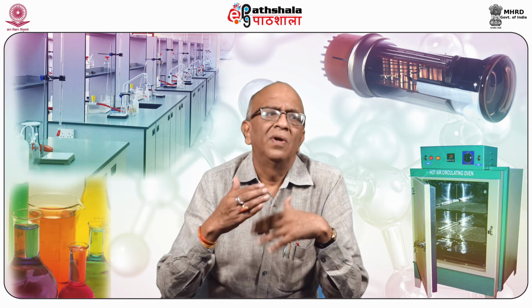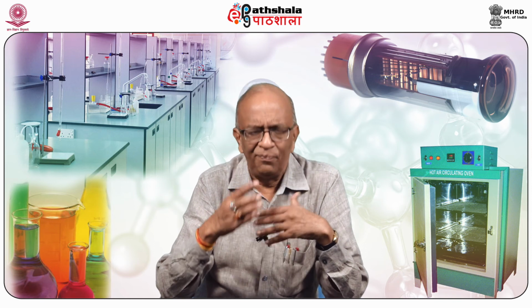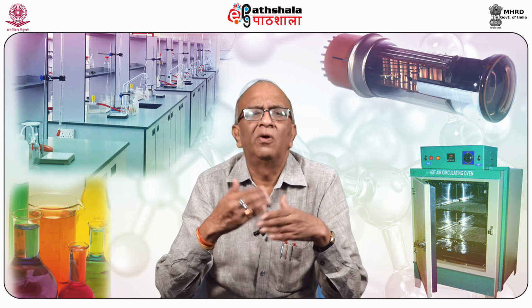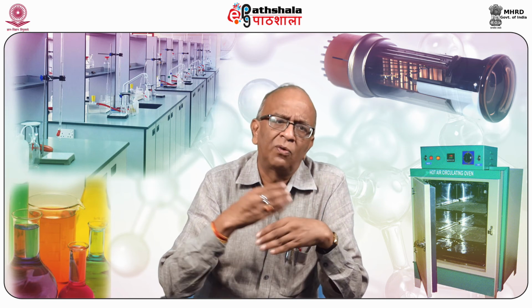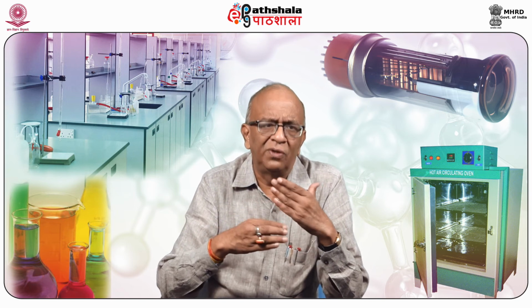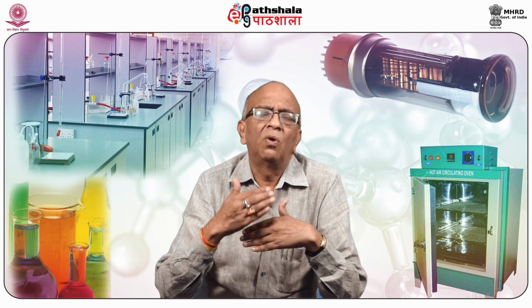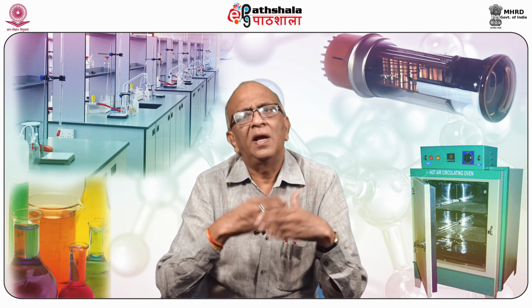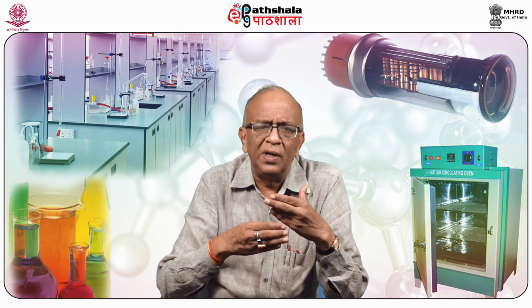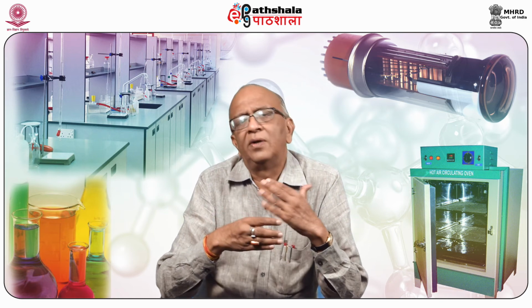Nowadays, commercially prepared plates are available in the market, on sheets of aluminum foil or tin sheets coated with different types of adsorbent. These plates can be used in very little time. Here also the parameter is Rf, a qualitative parameter by which we can identify an unknown substance.